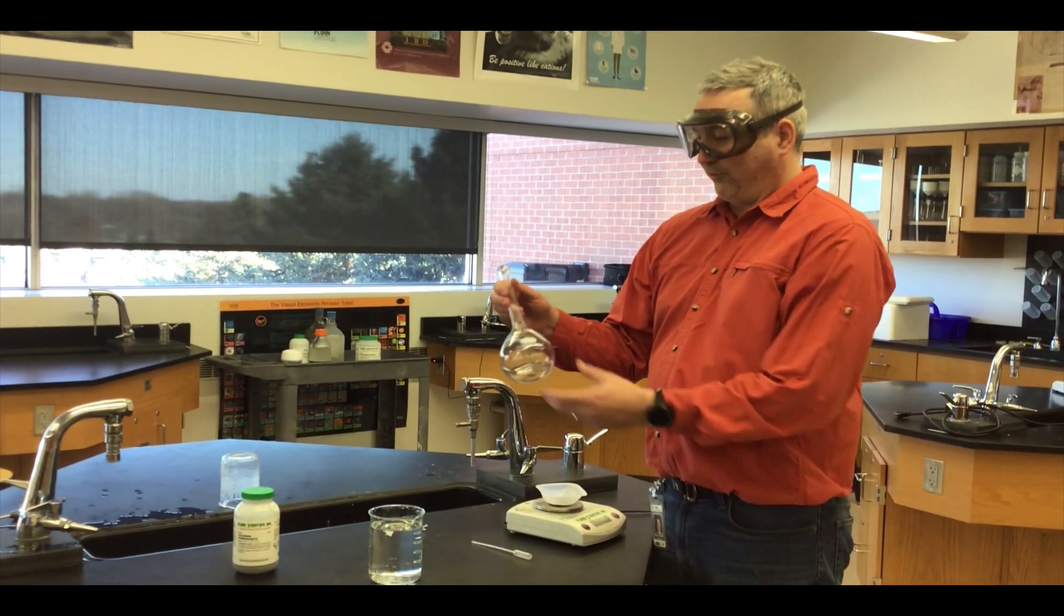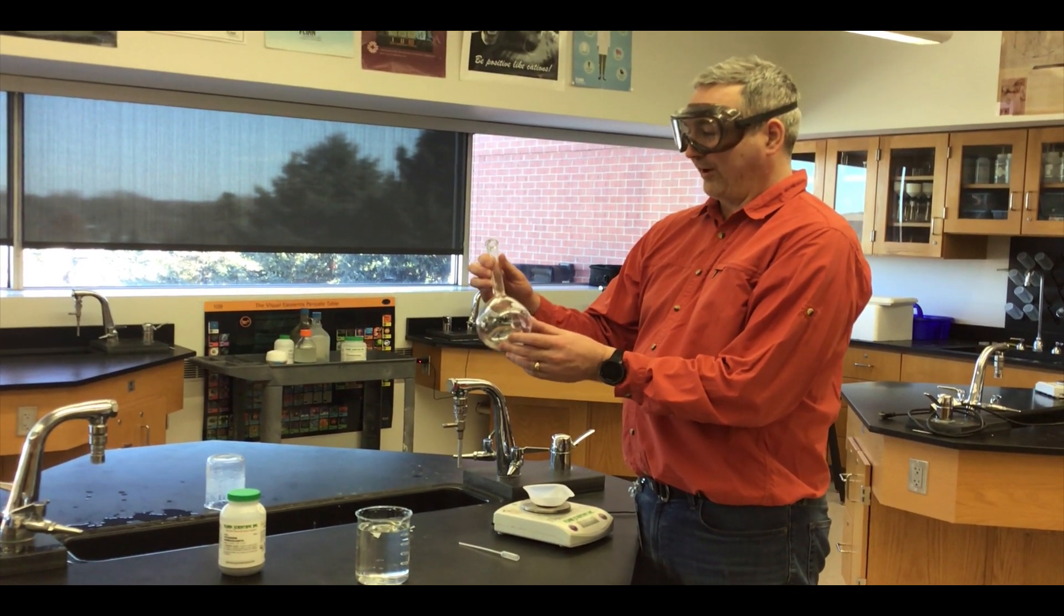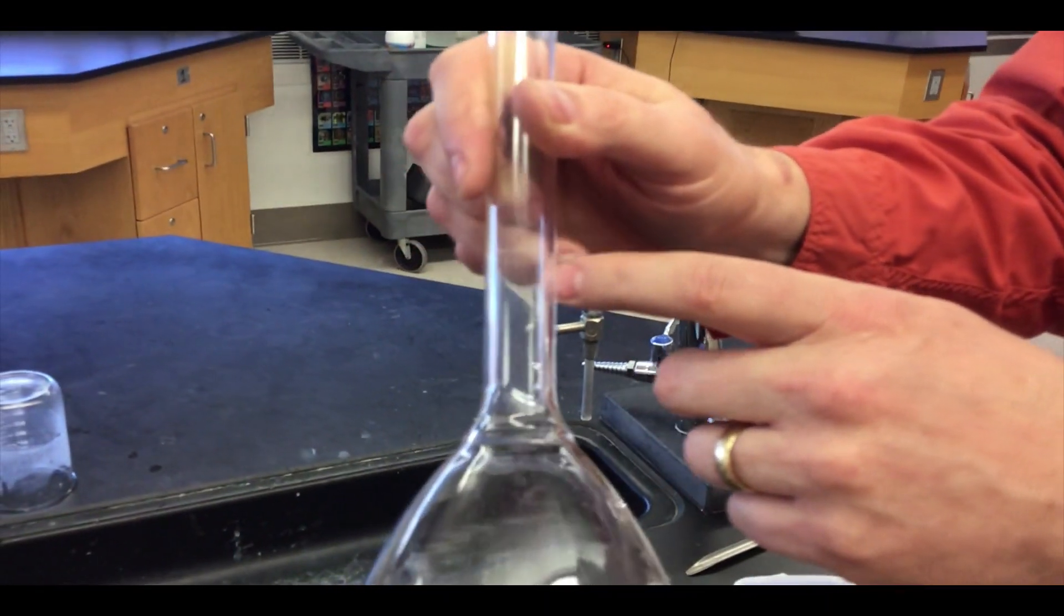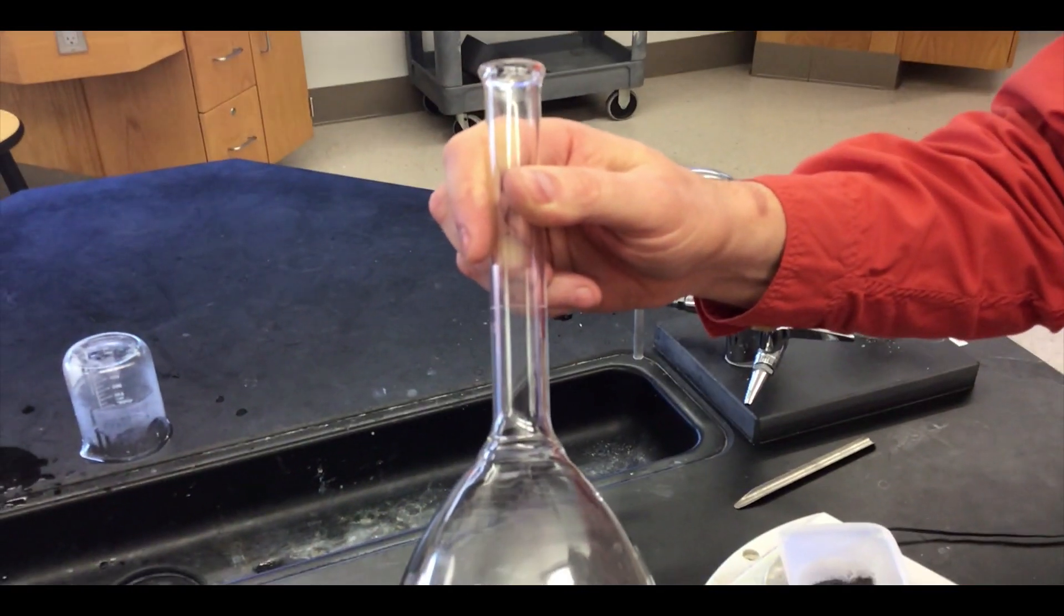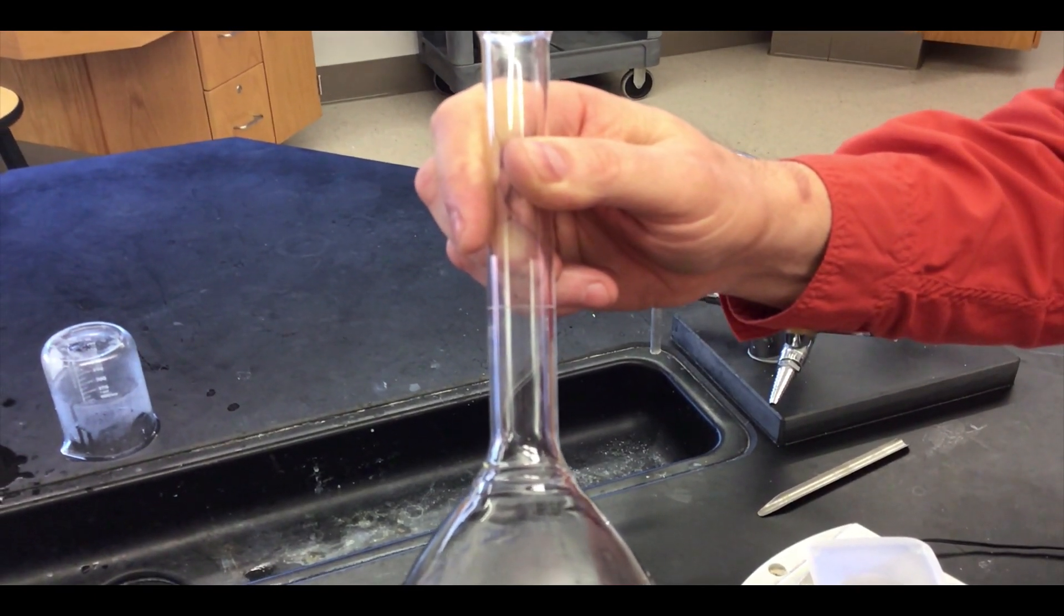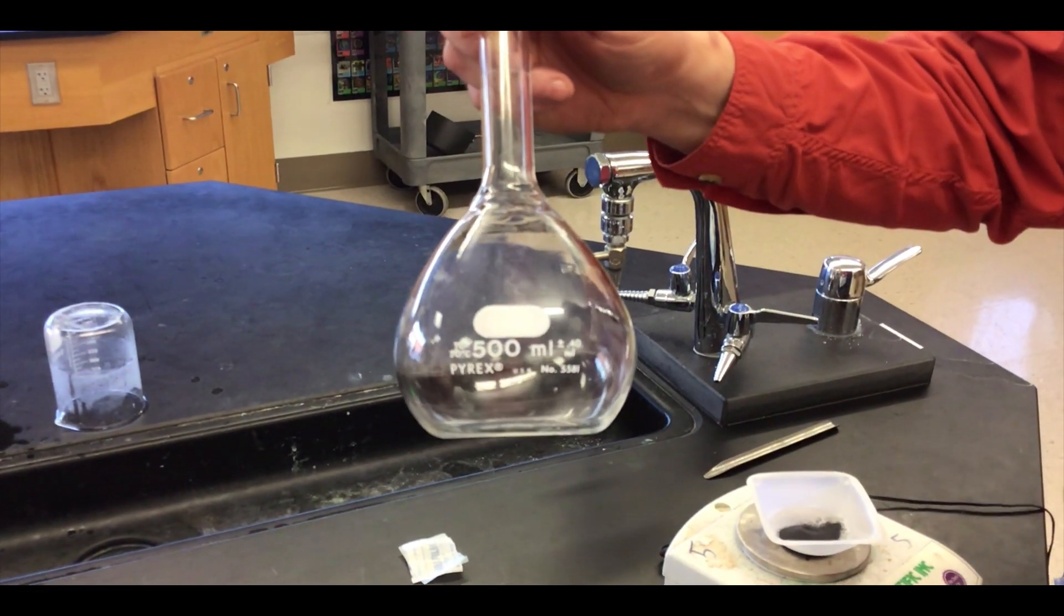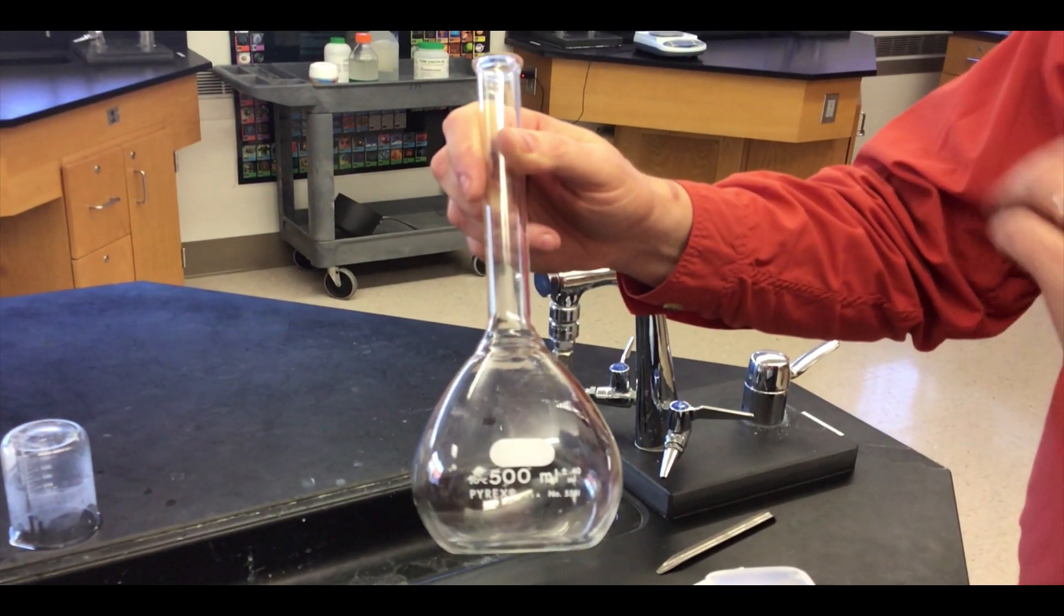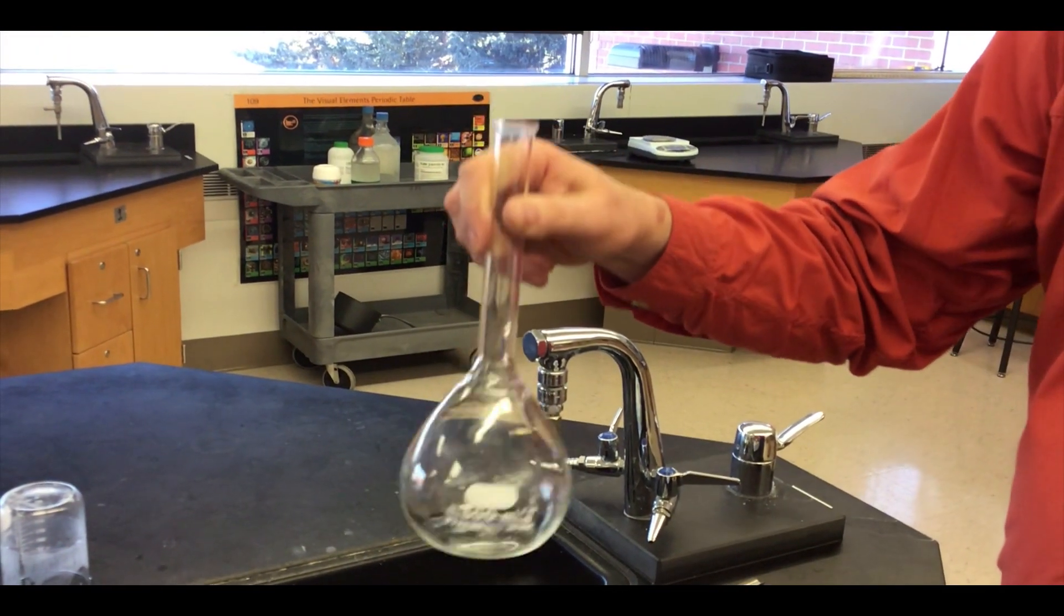We use a volumetric flask because they are easy to find the correct volume at. Right on the neck here if you zoom in we have a scratch mark that has gone all the way around the neck. They make this glassware and then they specifically fill it up with a very fixed amount of solution or water and then they scratch it off where it's right. So the scratch might be a little bit higher up on some or a little bit lower on some, but it's very specifically 500 milliliters and it's a narrow neck so we can swirl it around when we want to mix.